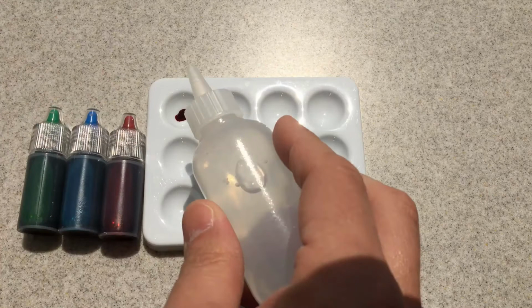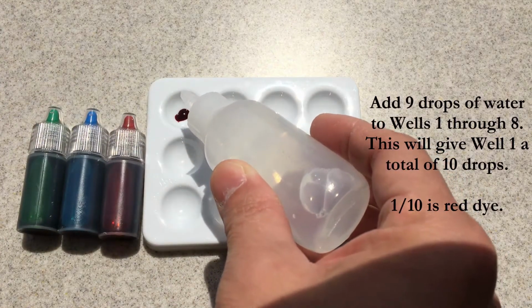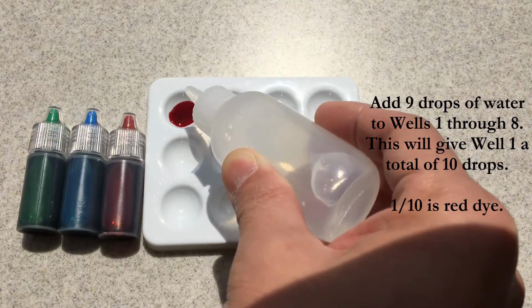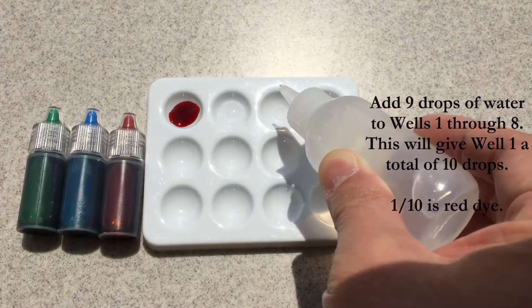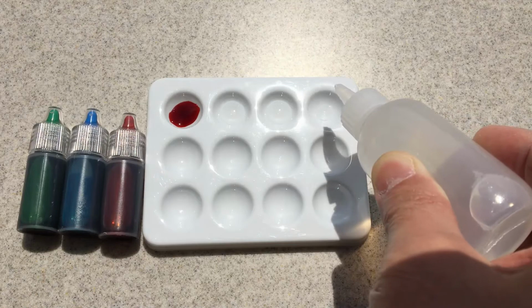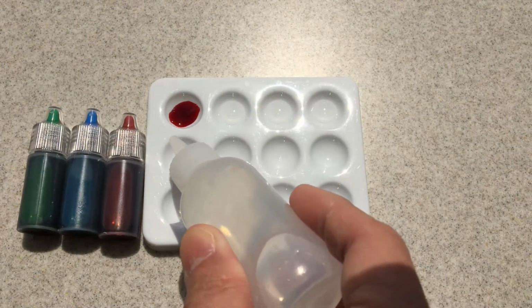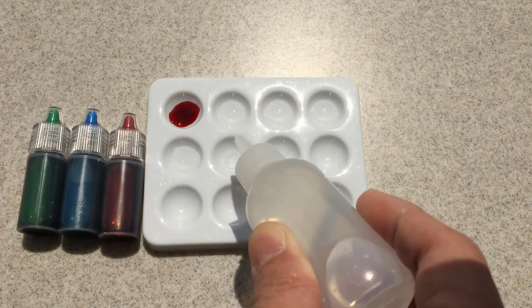So we'll add a single drop of the dye in the upper left well. This will be well 1. We're then going to add 9 drops of water to the first 8 wells. So you can see that the red dye has spread out as it's now associated with 9 drops of water, for a total of 10. All of the other wells, wells 2 through 8, will get 9 drops of water.